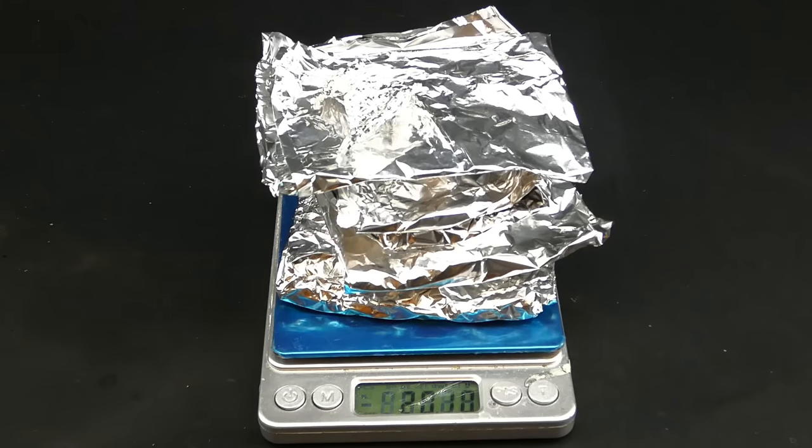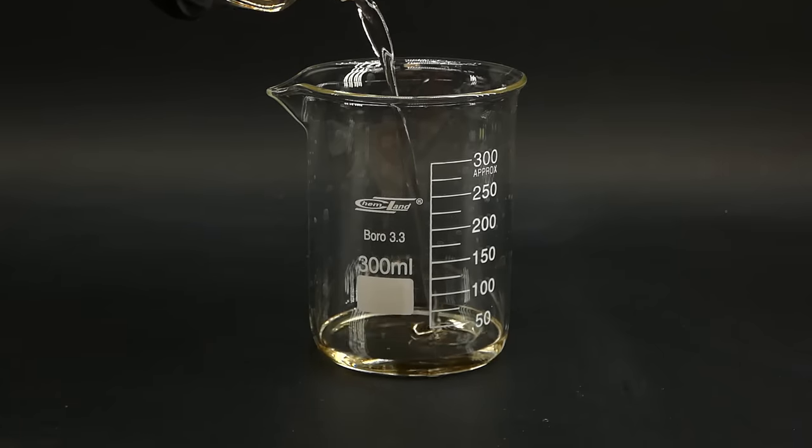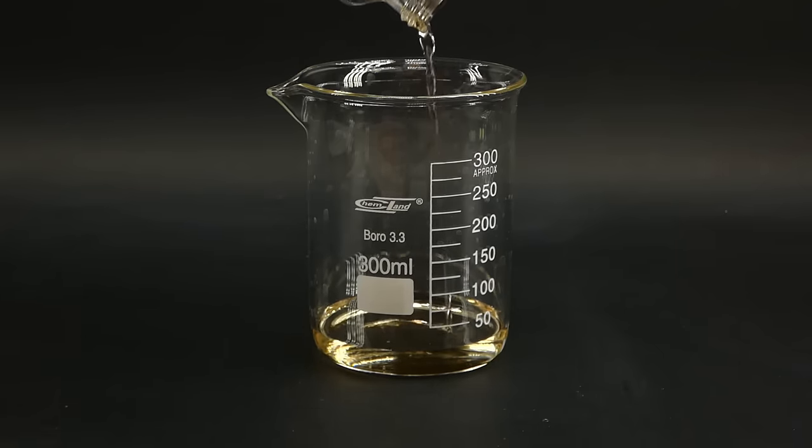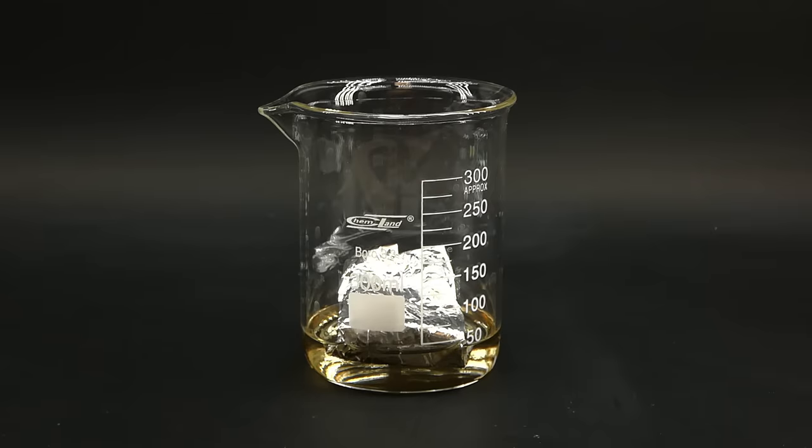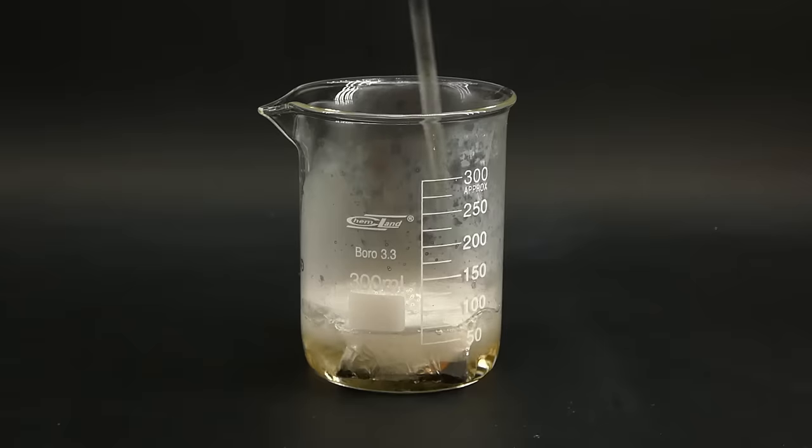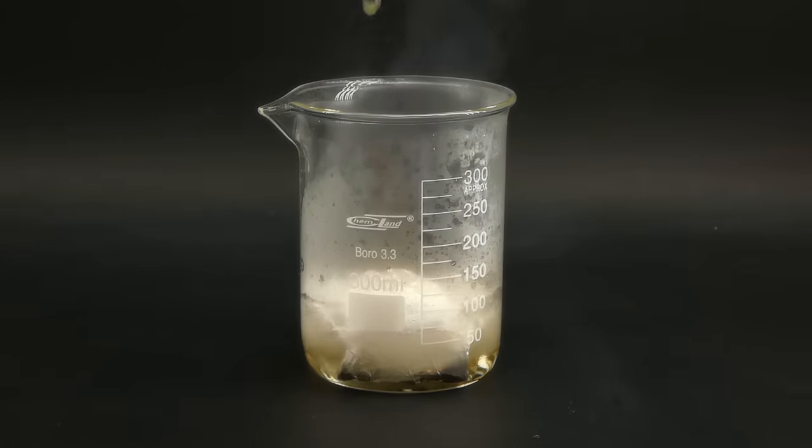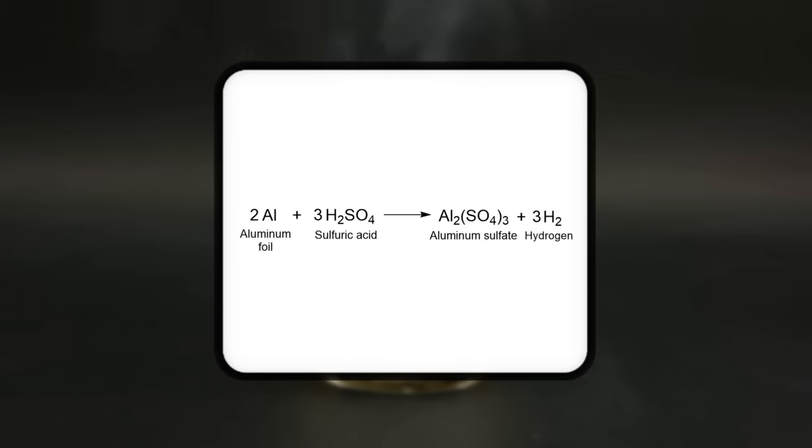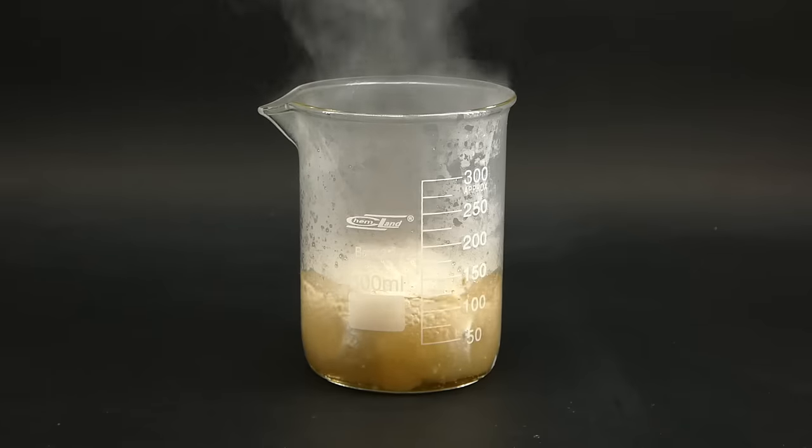To start I got some aluminum foil that I used to wrap my sandwich with earlier and got it onto a scale. I then topped off the weight to 20 grams using some more fresh foil. And to start dissolving it I poured around 30ml of concentrated sulfuric acid into a beaker and added a bit of the foil. Initially nothing happened but when I added some water a very vigorous reaction started to occur in which the sulfuric acid reacted with the aluminum to form aluminum sulfate and hydrogen gas.